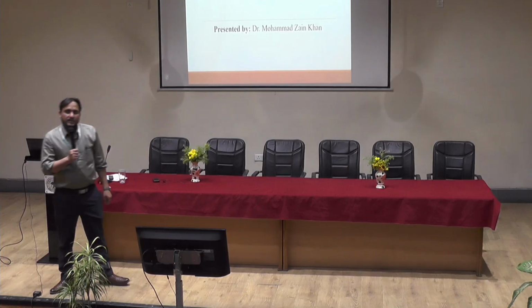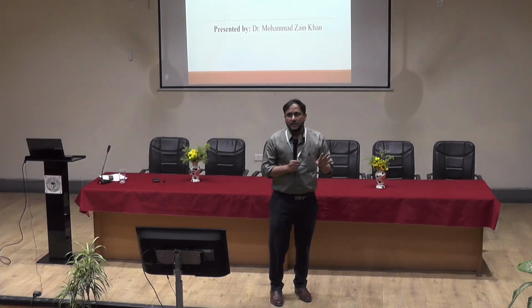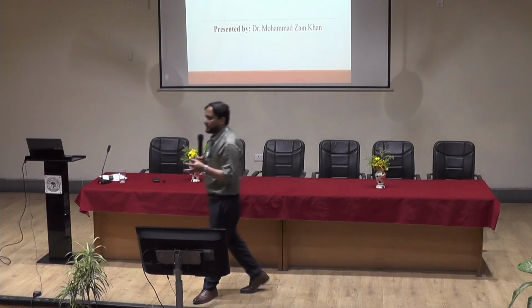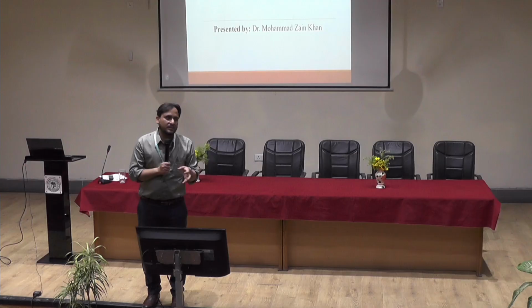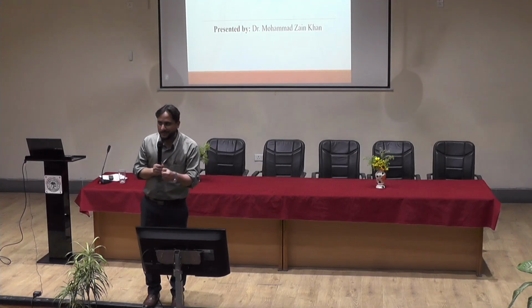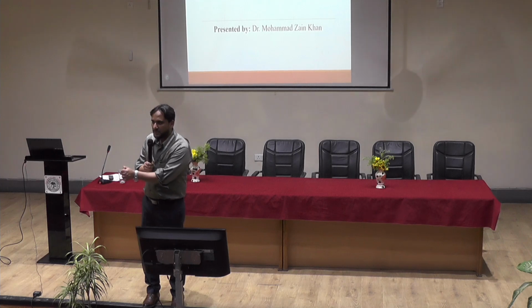In any spectroscopic technique, the two main units of the spectroscopy equipment are the detector as well as the light source. So for Raman, we use laser, light amplification by stimulated emission of radiation.